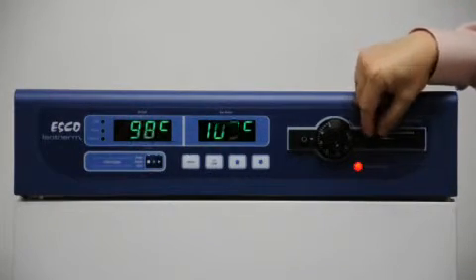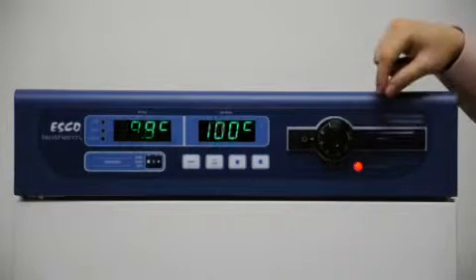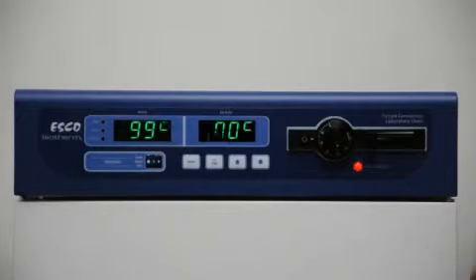Last but not least we have airflow adjustment, which basically opens and closes a vent at the rear of the chamber to regulate the air exchange rate.